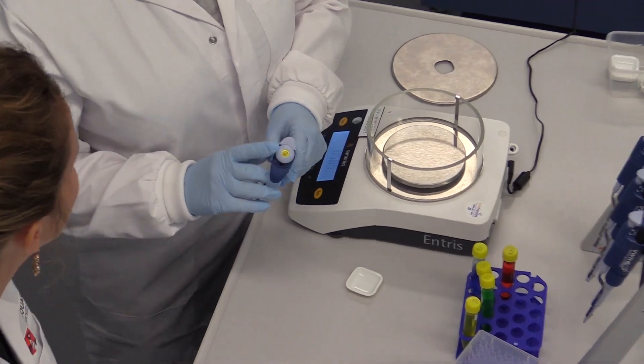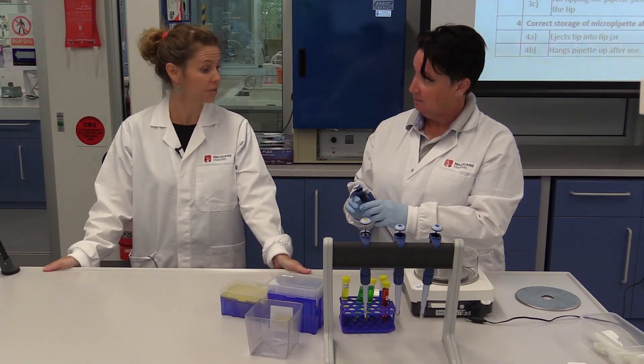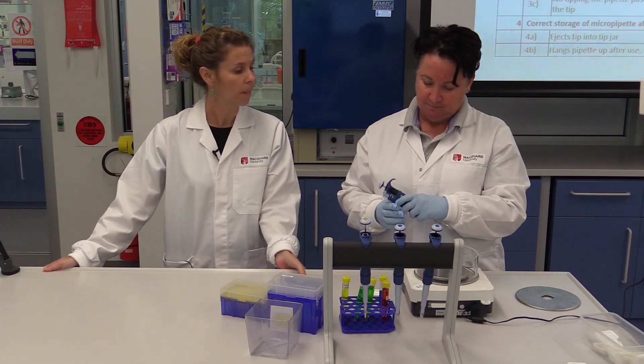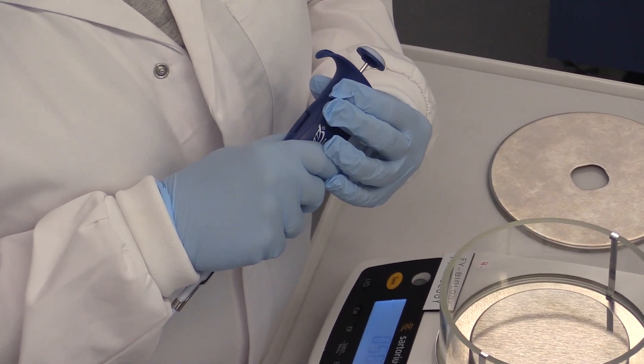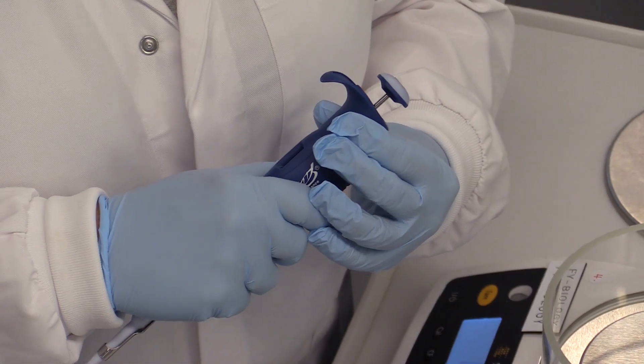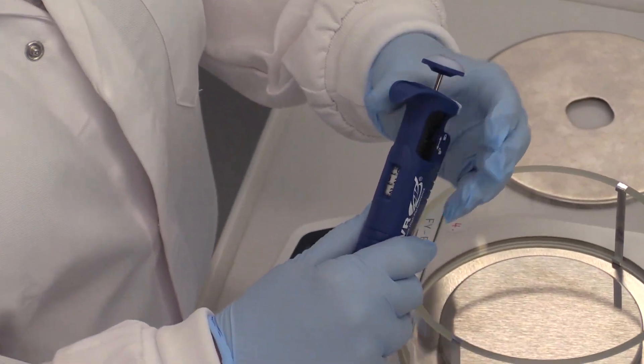So, I'm picking up the one with the yellow top. Okay, is this right? 100 — yeah, okay. What volume do you...? 22. Perfect. So, I've wound it up to 22.